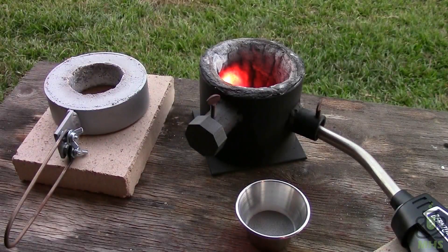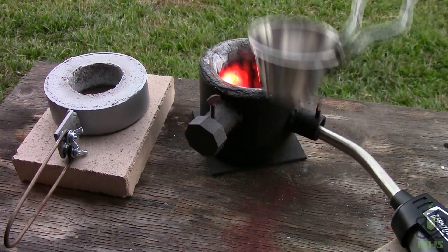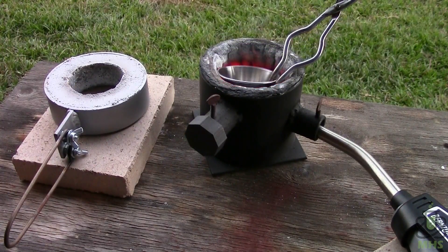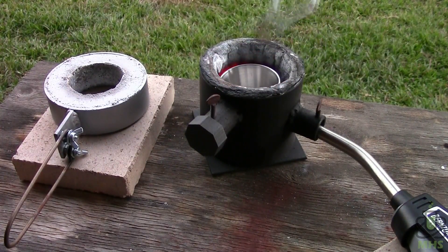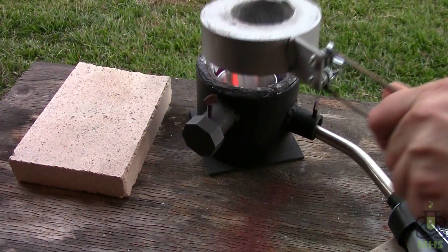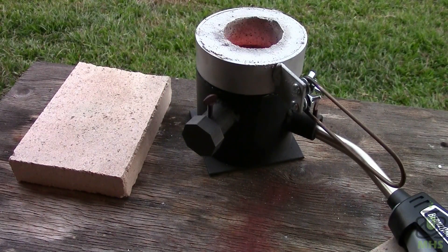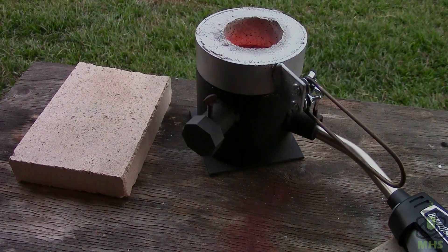I've brought everything outside and the furnace is running. We're going to put the crucible full of material in there, put the cap on it, and let it heat up. This is going to take several minutes while the materials reach their activation temperature, and then we should get the reaction to happen.